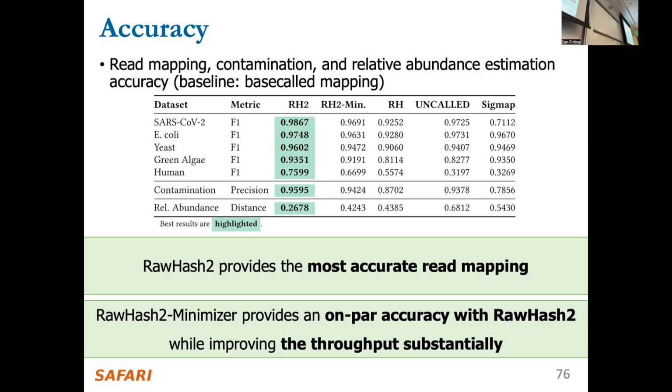I omitted that detail again in my talk, but when you have subsequent events whose values are close to each other, we only pick one of those, because of the effect that you just described. The segmentation algorithms are not perfect, first of all, so they may not identify the events correctly. The second is that there's this lingering effect going on. So if they are close to each other, there's a high chance that there's an error. So I pick the first one, and then the next one that I pick is the one that has a certain difference from the one I picked. So we pick those so that they are different enough.